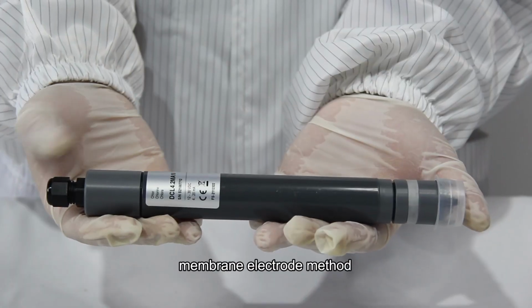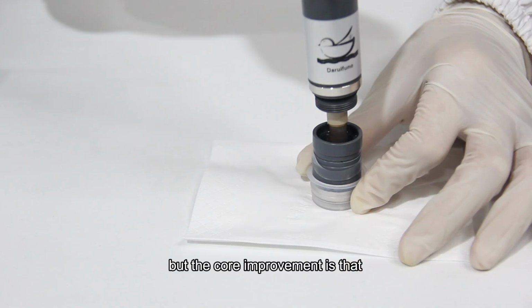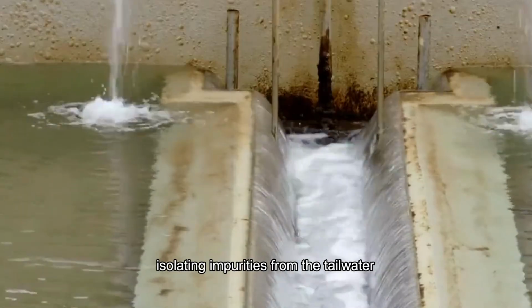Membrane electrode method. The principle is similar to constant voltage electrolysis, but the core improvement is that the electrodes and electrolyte are encapsulated in a sealed chamber, with a selective membrane isolating impurities from the tailwater.